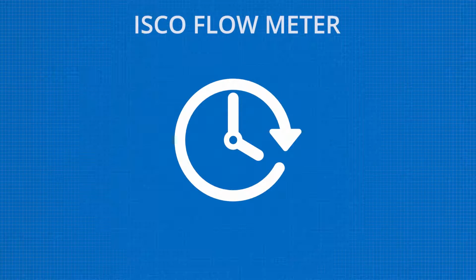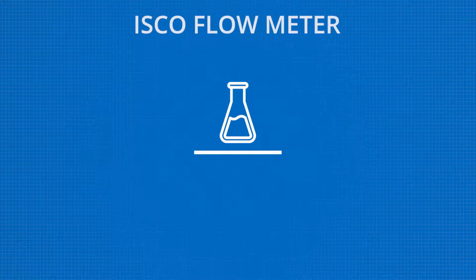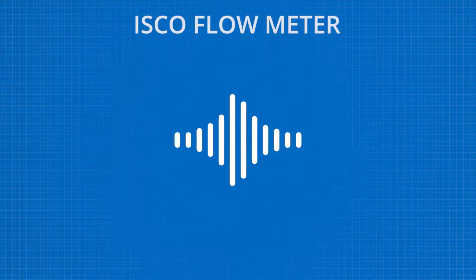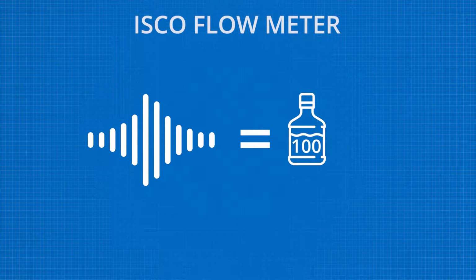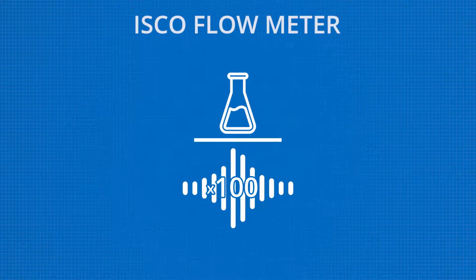Begin by calculating the interval which you want the sampler to actuate. For example, if you are required to collect a sample every 10,000 gallons and each pulse represents 100 gallons, you would program the sampler to collect a sample every 100 pulses.